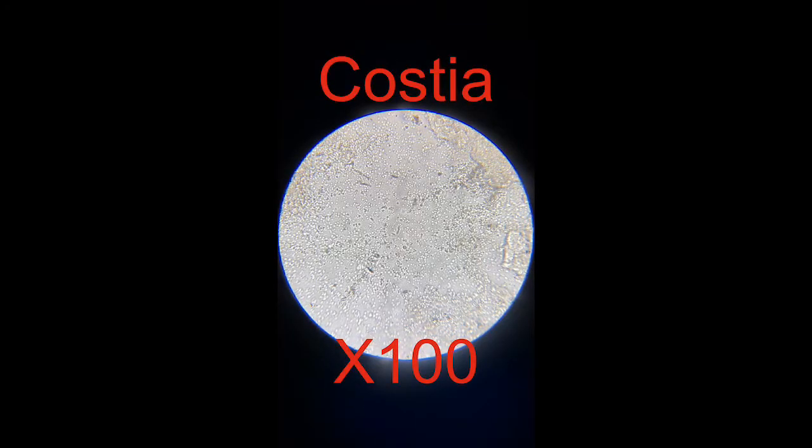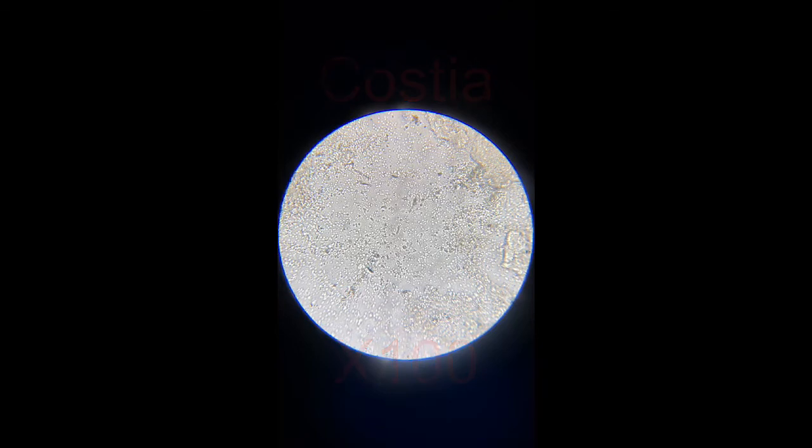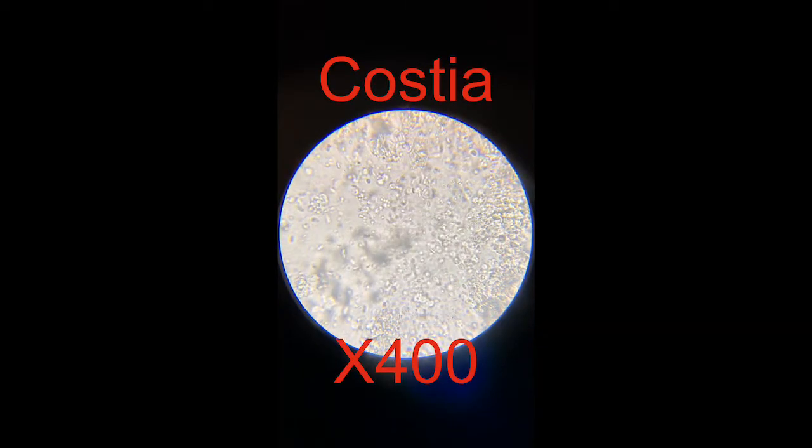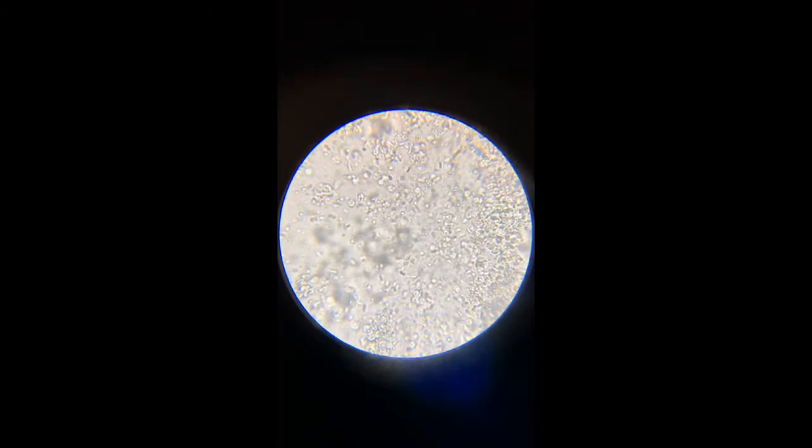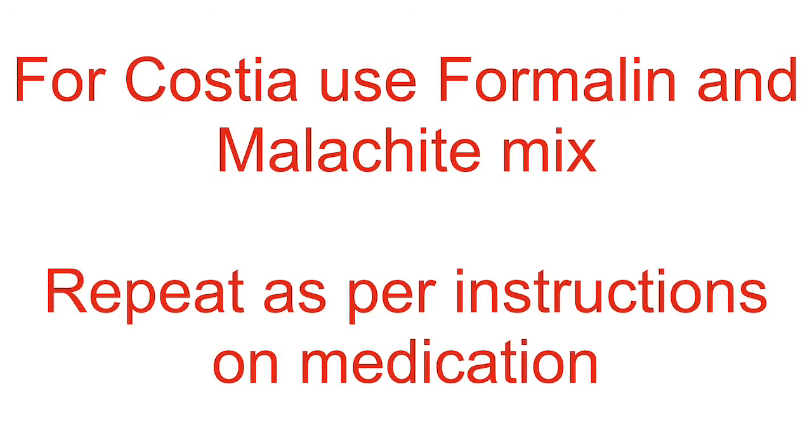And then lastly, we've got costia, which is on times 100 and it's still very, very small. So you really need times 400 to see them. They look like spinning, darting commas. If you have a problem with these, you need to use formalin and malachite green as per the instructions.